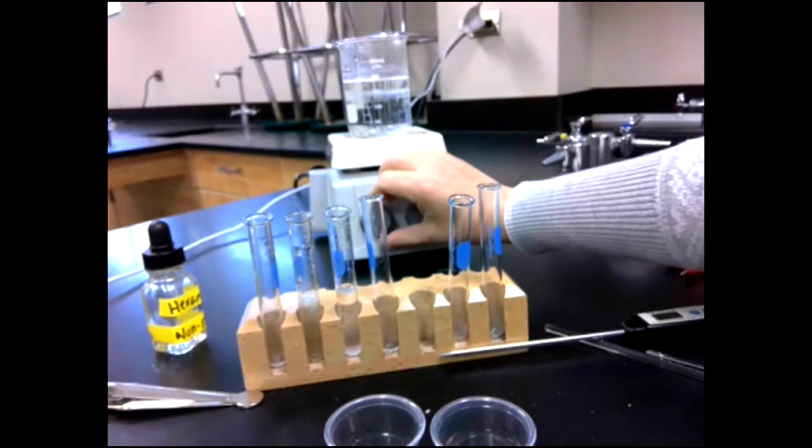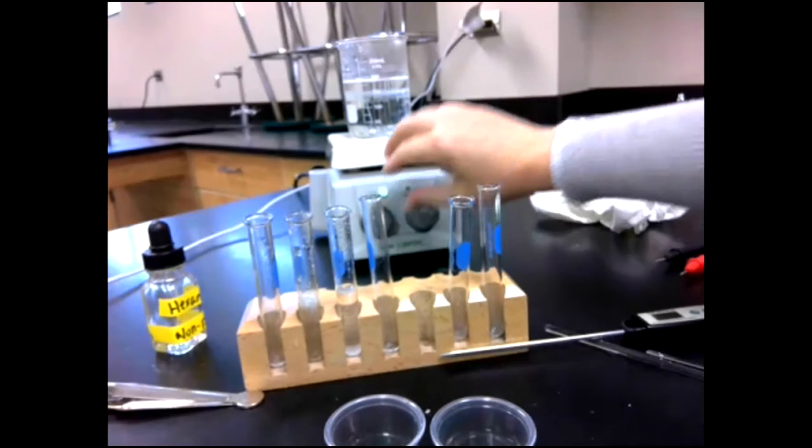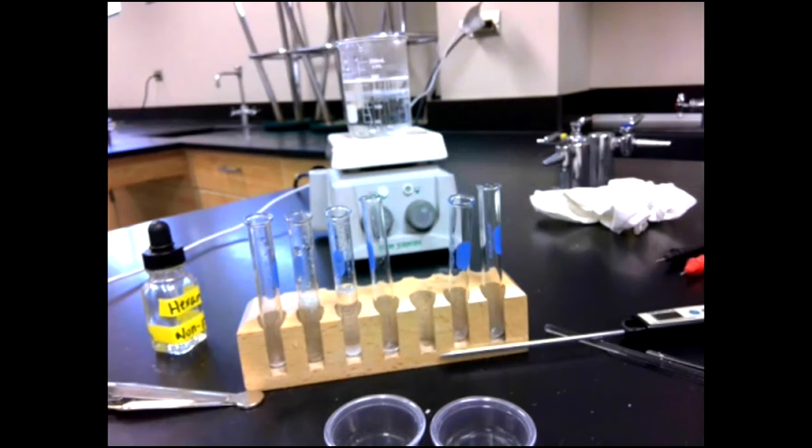Question. Sure. Wait, was B conductive or no? It was not. Okay, thank you. So it stayed on 1, which means resistance is high. It's measuring resistance, and the resistance is very high, which means it's not conducting at all, absolutely no conductivity.